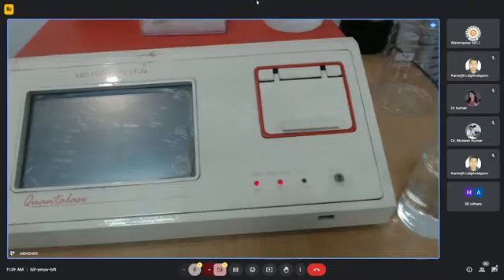Most of the organic species present in natural water fluoresce mainly in the blue region when excited by UV light. This fluorescence can be blocked partially using optical long pass filters, allowing only wavelengths above about 475 nanometer. However, this does not eliminate the fluorescence from organic matter.